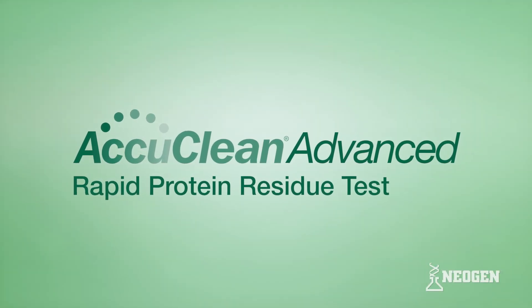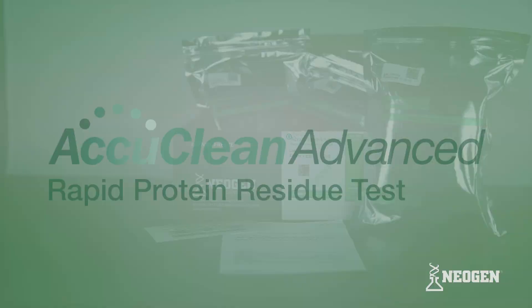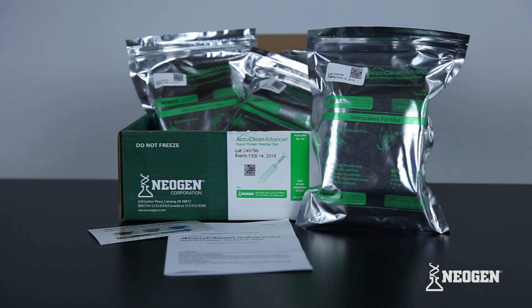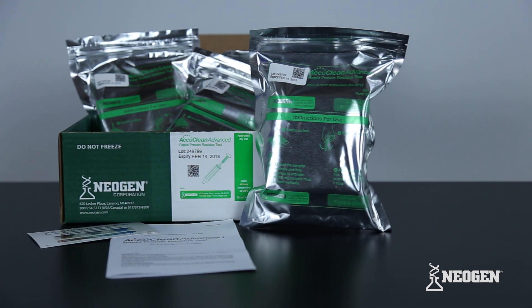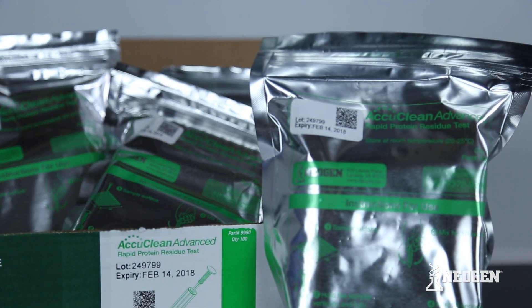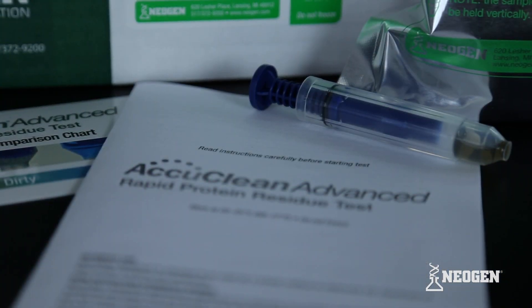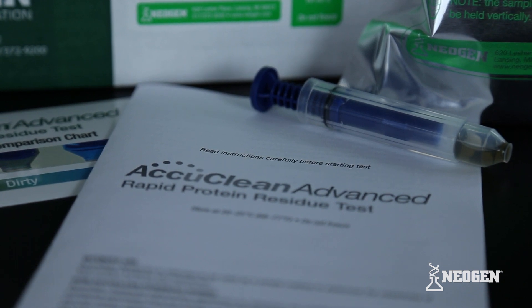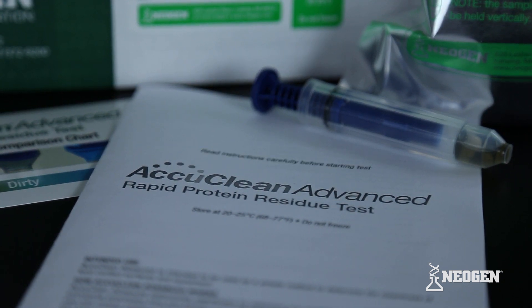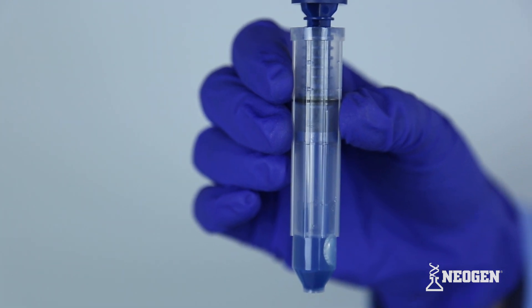Neogen's AccuClean Advanced Rapid Protein Residue Test assists in determining the cleanliness of food contact surfaces and equipment with industry-leading speed and sensitivity. AccuClean Advanced is a simple 10-second visual test that reveals detected protein residue through an easy-to-interpret color change. With a protein detection limit of 10 micrograms, AccuClean Advanced provides sensitive, reliable results in real time.